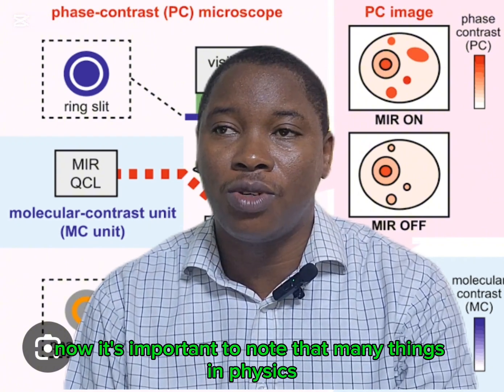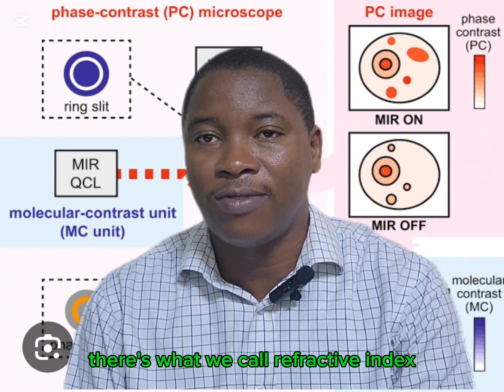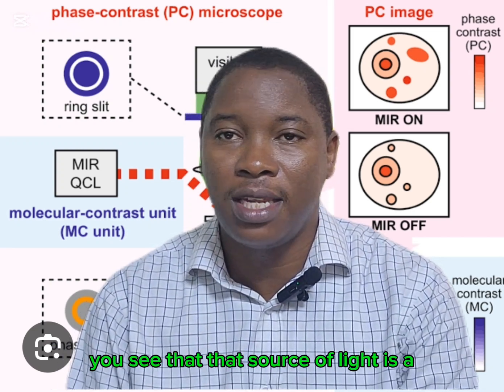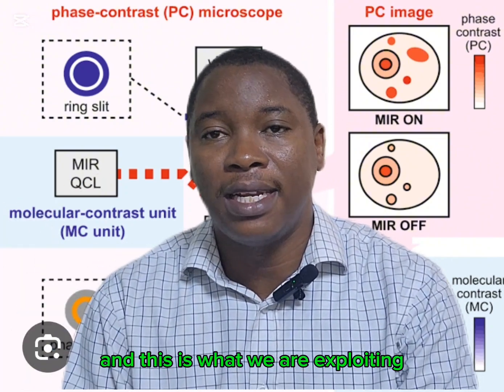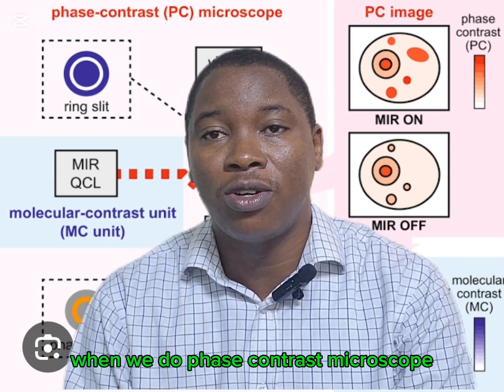Now, it's important to note that in physics, there's what we call refractive index. If you are looking at a source of light, if it passes from one phase to another phase, you see that the light bends in the way it is moving. And this is what we're exploiting when we do phase contrast microscopy.